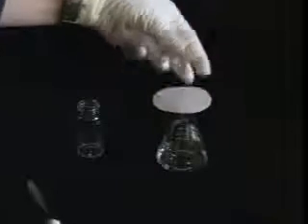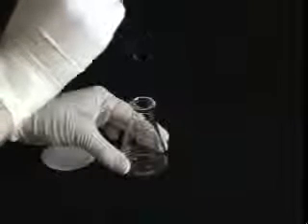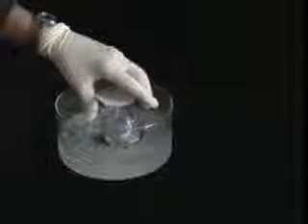If you forgot to set aside a seed crystal, you can also try dipping a glass rod in the solution, letting it dry so that the minute crystals form on the surface, and then dipping it back in. When crystallization has begun and your flask is at room temperature, place it in an ice bath to drive the crystallization to completion. Leave it in the ice bath for at least 15 minutes before collecting the crystals.